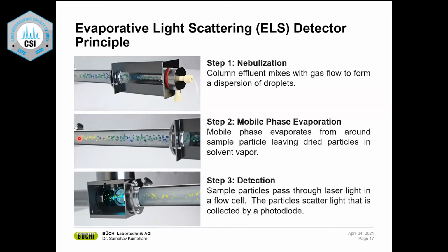this tube, drift tube. Now, a standard design, or what I say, a normal ELSD would actually heat this drift tube and help the solvent molecules to completely evaporate out of your sample, and only let the sample reach your detector at the end over here. That is what typically happens in an ELSD. That is why it's called an evaporative technique. It evaporates your solvent off completely.